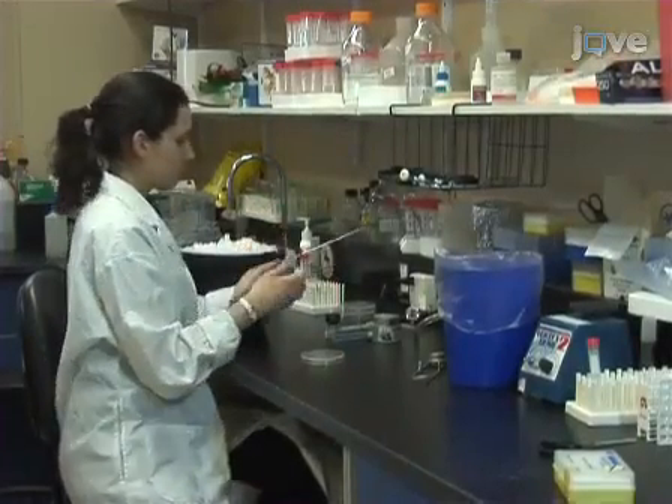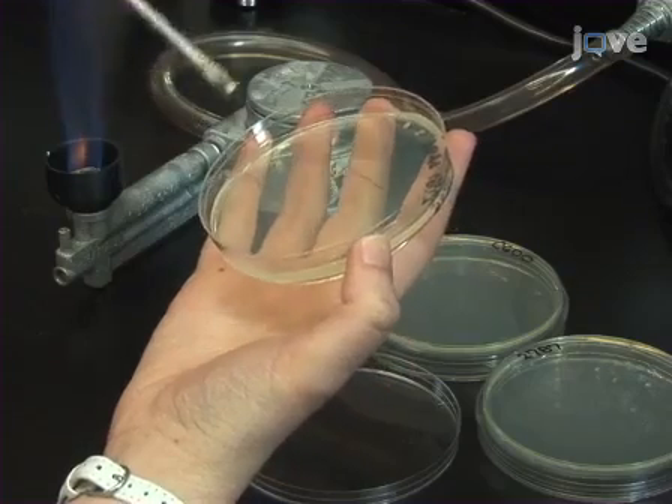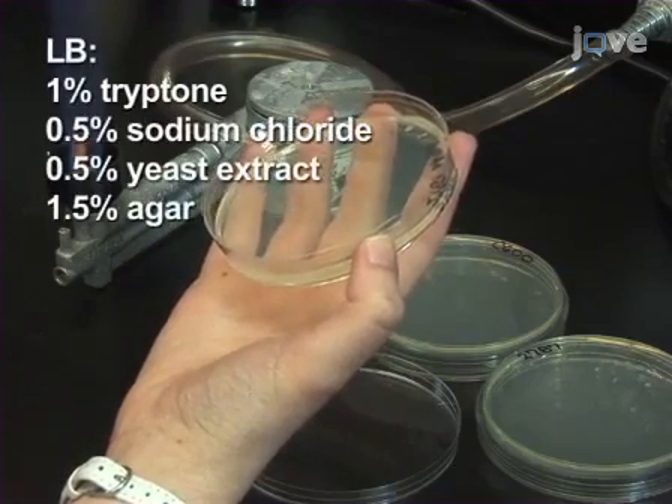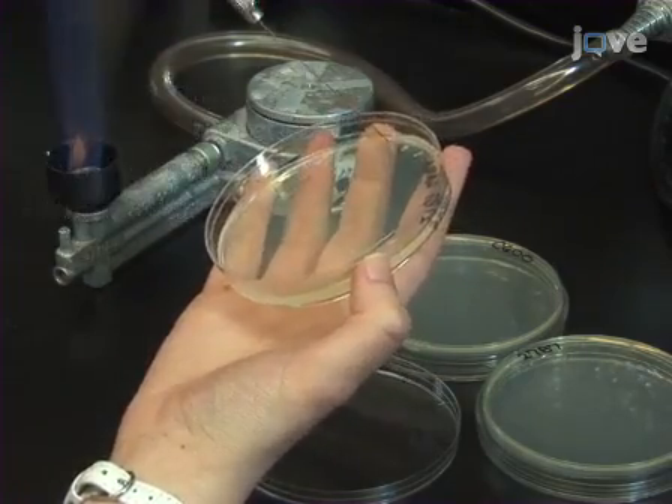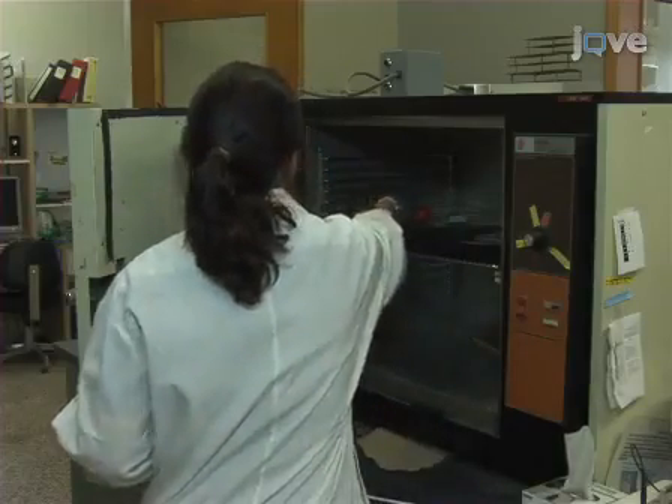To prepare the bacteria used for this study, freshly plate bacteria from glycerol stocks, such as Escherichia coli pathogenic strains as shown here, on lysogeny broth agar plates and incubate at 37 degrees Celsius.